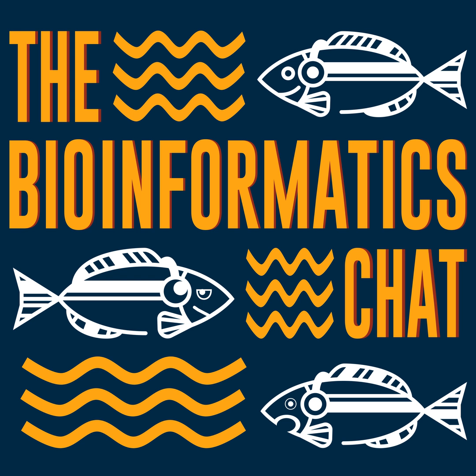They initially were trying to error correct PacBio. PacBio was historically the first long read sequencing technology, and they used to error correct PacBio reads with Illumina. This is challenging by itself, because you need to map these short reads to your long and noisy reads. Then you substitute the mapped parts of the long reads with your short Illumina sequencing, and you continue to do this with the next Illumina reads and so on. In the end, you theoretically will get accurate and long reads, and then they were using Celera assembler to get your final contigs and chromosomes.